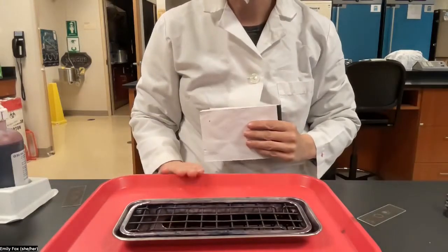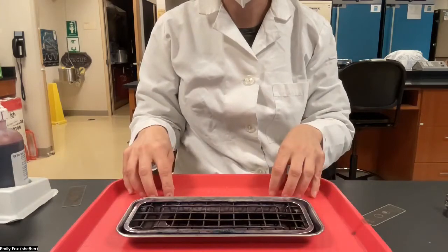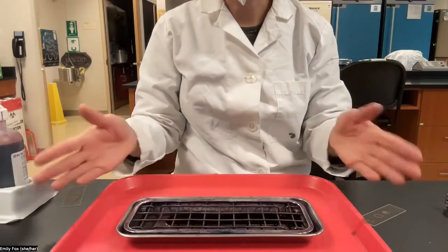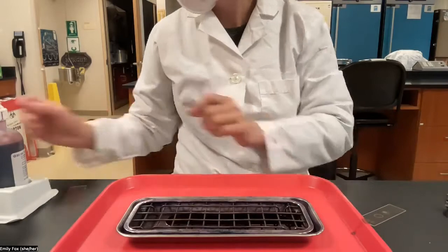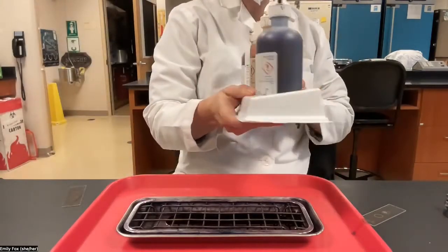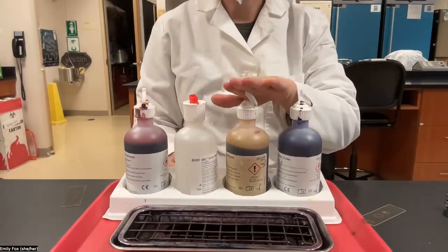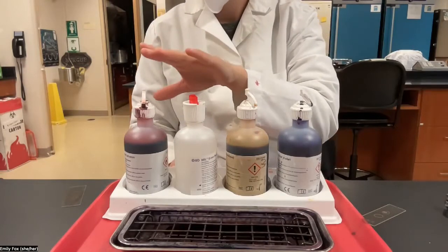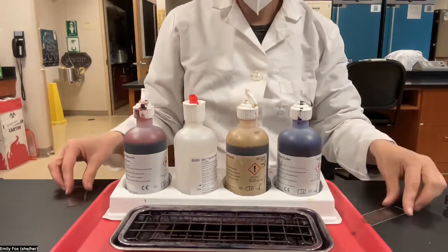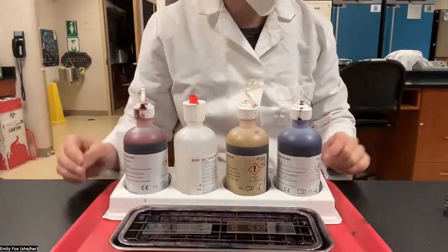Staining is always going to take place on the tray. We want to keep our staining tray in the cafeteria tray so that we don't splash stain all over the countertop. Here are our four stains. We're going to use crystal violet, iodine, alcohol, and safranin red. You can stain two slides at the same time, just put them both on the staining tray.